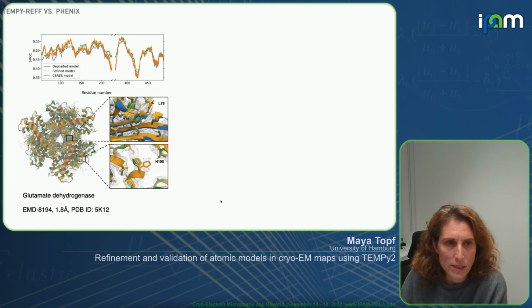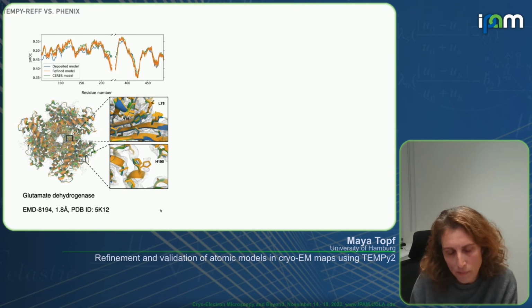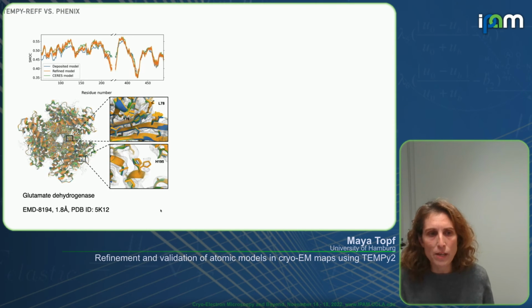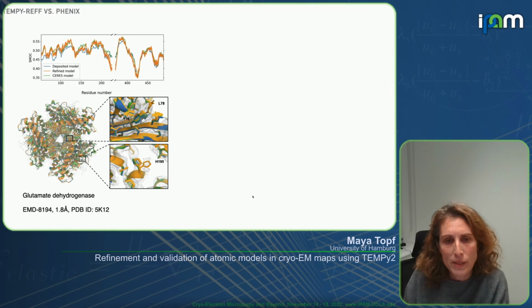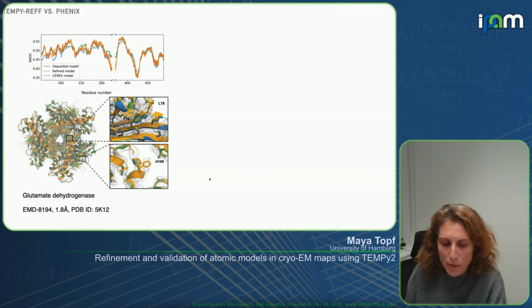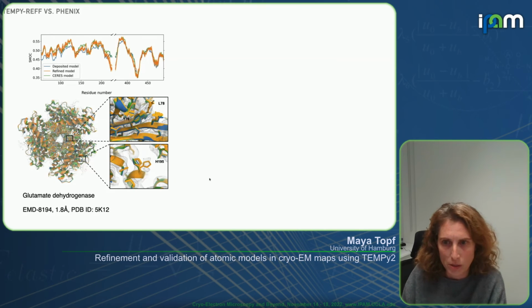Okay, so just another example that I'm showing here is using this approach of ensemble representation, which I'm sure you've heard quite a few times over the last few days. But I'm showing this example because it's really nice. You can really see this histidine in two conformations. So we're potentially starting to look at multiple occupancies here.